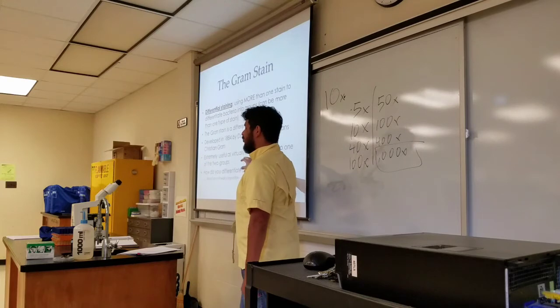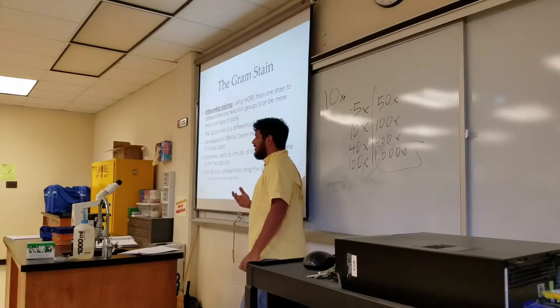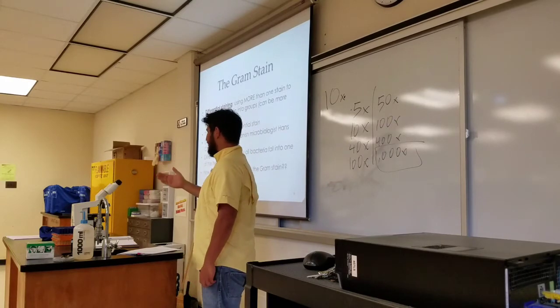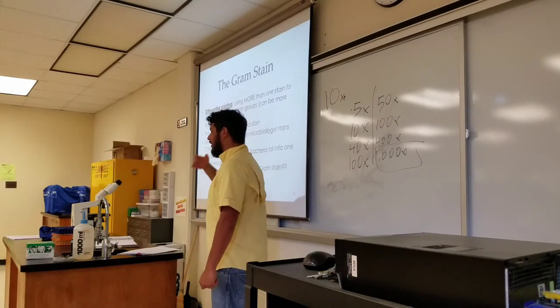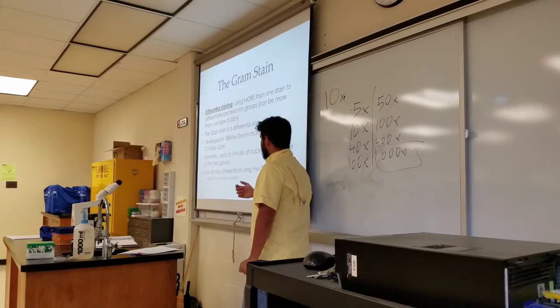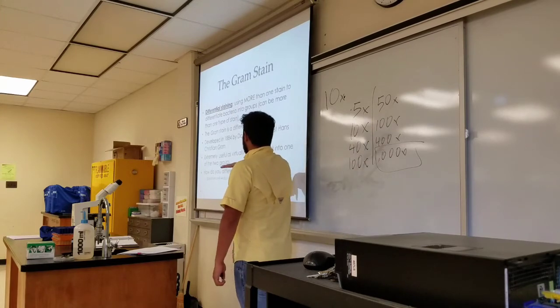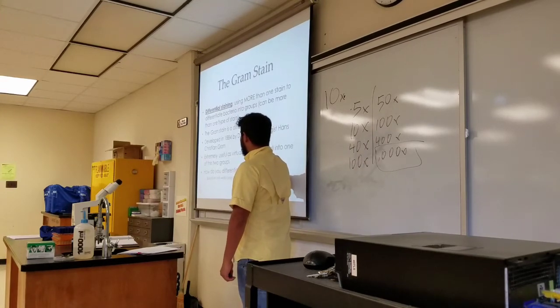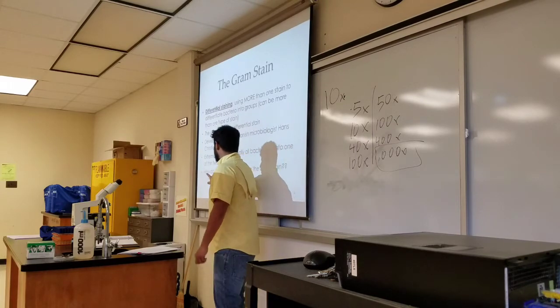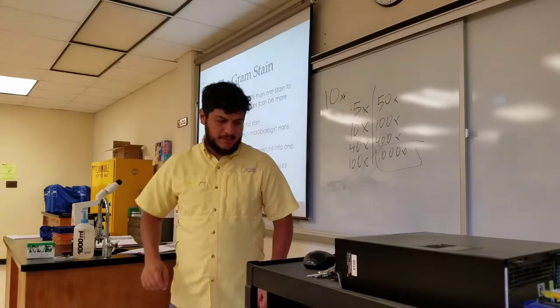Now, this is really useful because every bacteria, or almost every bacteria, falls into either one of these two categories. And they have a morphological and biological significance. It's extremely useful, and it helps us differentiate based on a biological component, which is the cell wall composition.